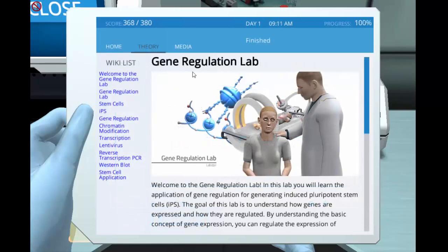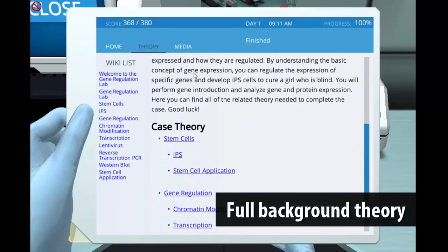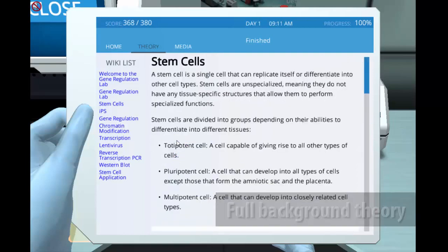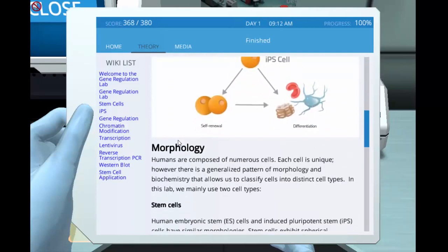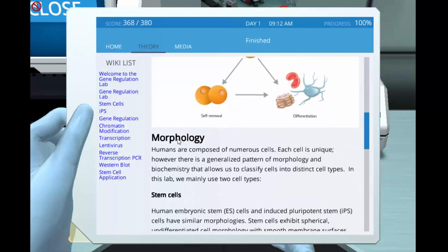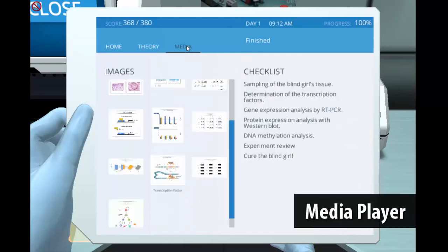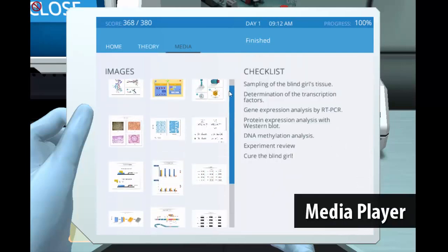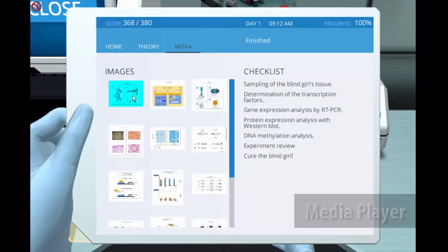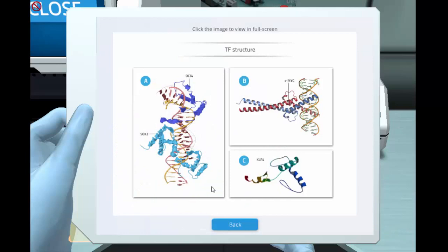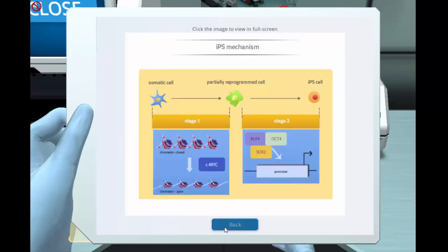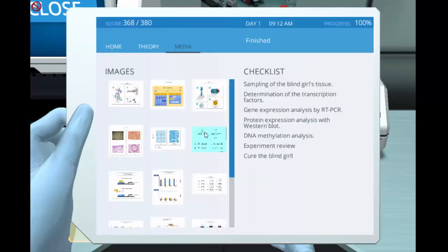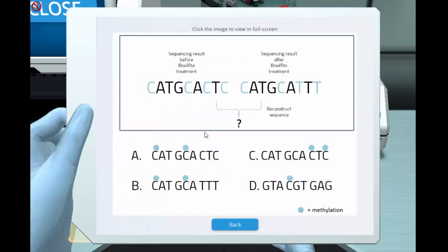Besides the core lab, Labster provides a full theory section, which provides the student with relevant background information when needed. Also with the media player function, students will be able to see the animations, graphs and collected data several times during the lab, as well as at a later time for exam preparation.